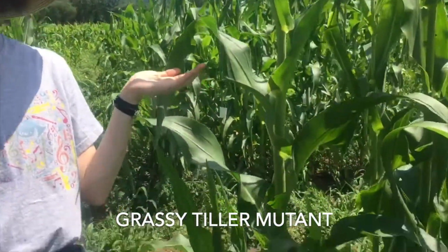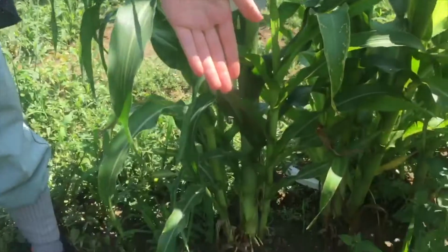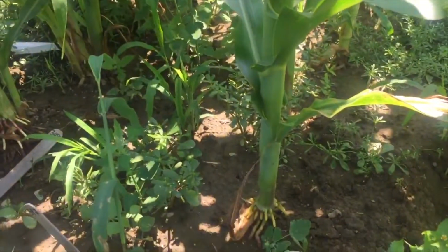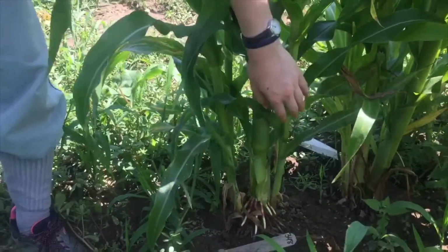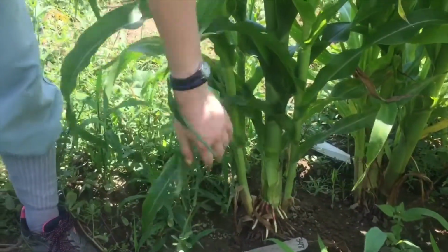Here we have a grassy tiller mutant, or a GT mutant. If you compare it with the wild type, which has one singular stalk growing up from the ground, the GT mutant has many little stalks that are called tillers.